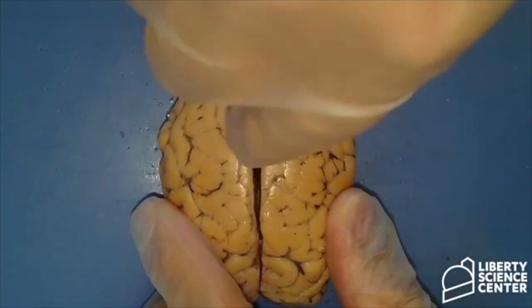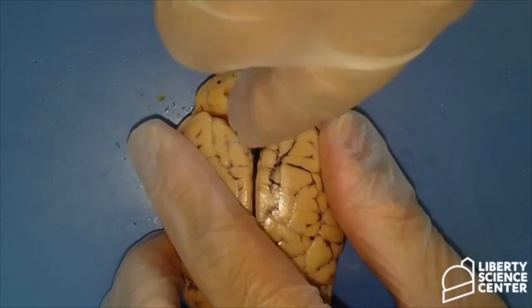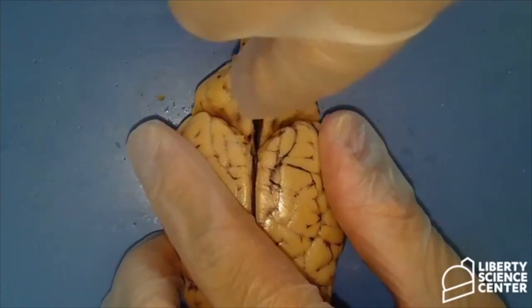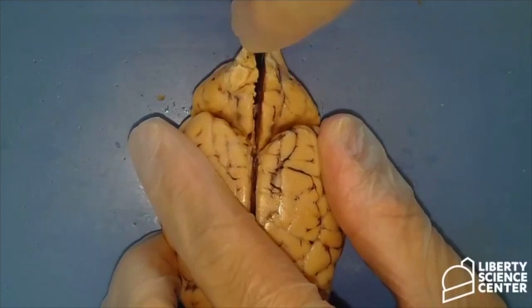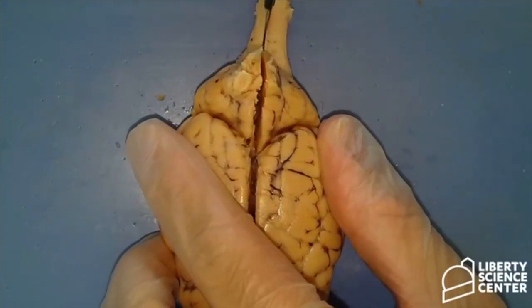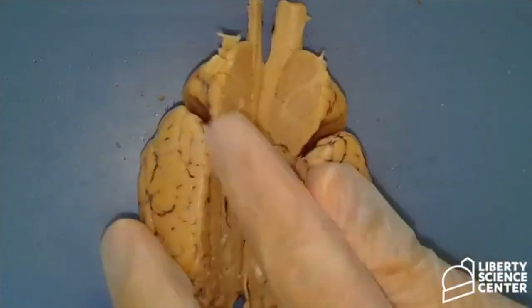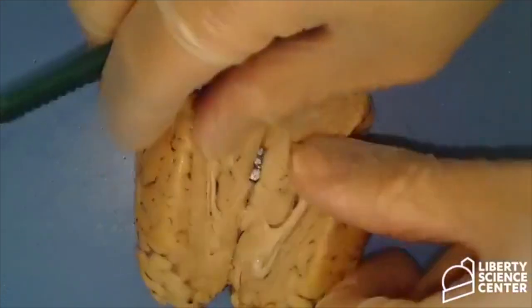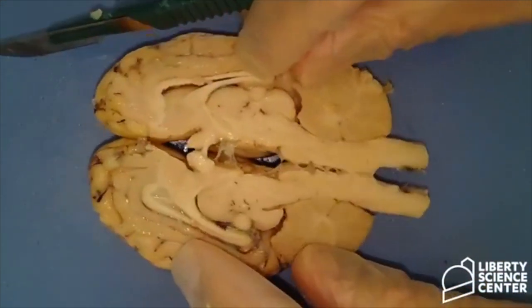As some of you mentioned, it is pretty soft. It's pretty easy to cut through. So it's one of the advantages of doing a brain dissection. It's very easy to dissect through, and a lot of the structures inside usually remain intact. So there we have the cut open brain.